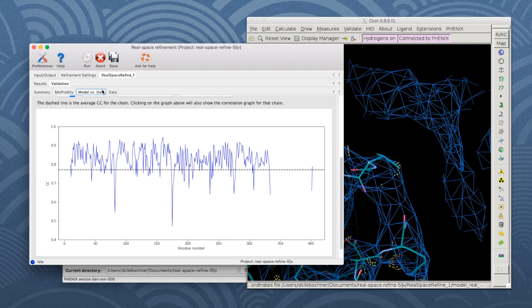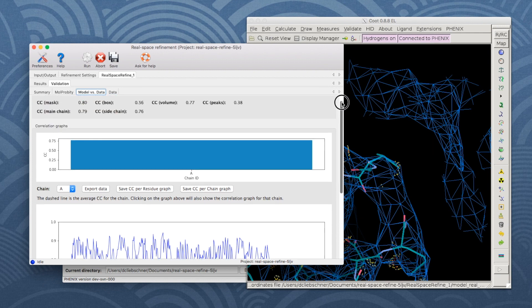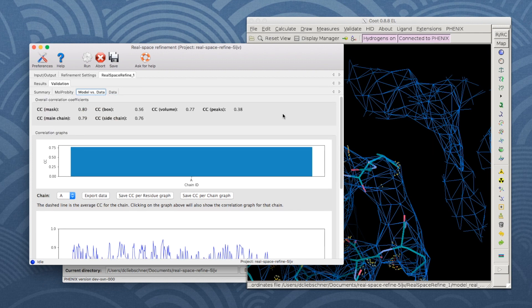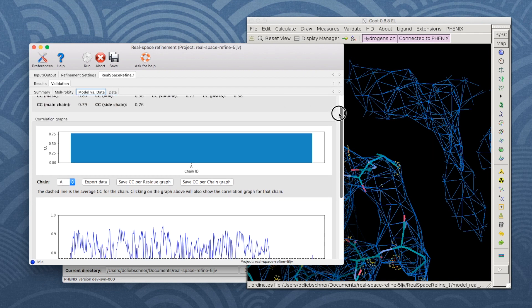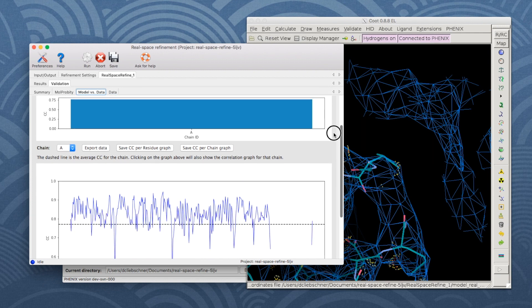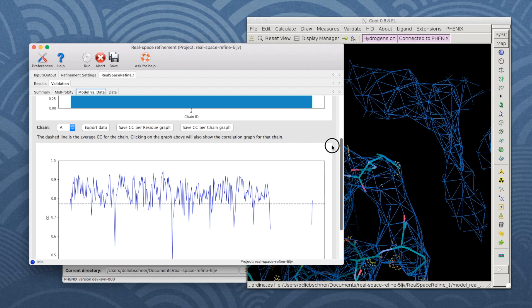The model to data fit is shown in the Model vs Data tab. It lists overall correlation coefficients and features a plot of the correlation coefficient per residue.